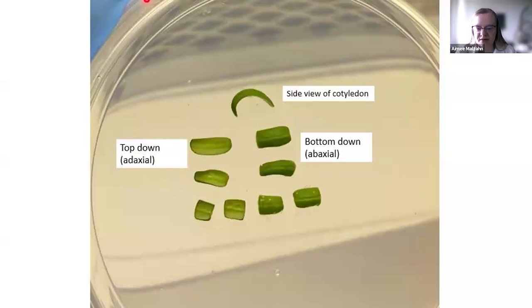Thanks. And then there's a question from Elsa asking what age the plants should be for transformation. I already germinated my tomato seeds, but they're very small, 8 days old. If I use older plants, would that affect the protocol? Once you have true leaves, that will affect the protocol. As Carrie mentioned, once you start to get true leaves from those tomatoes, the cotyledons change physiologically and probably cellularly, and they don't respond as well.